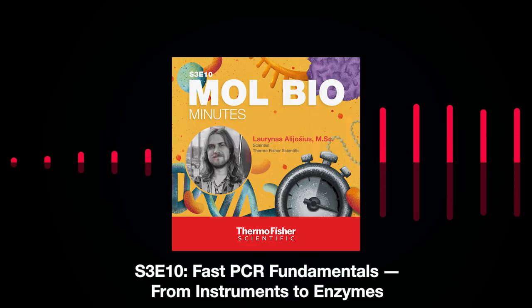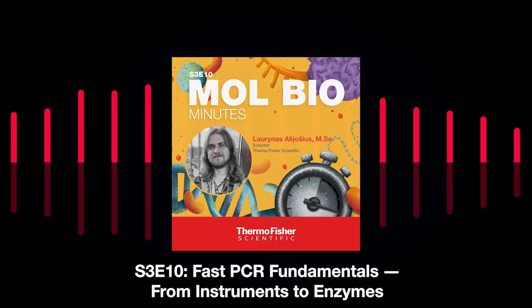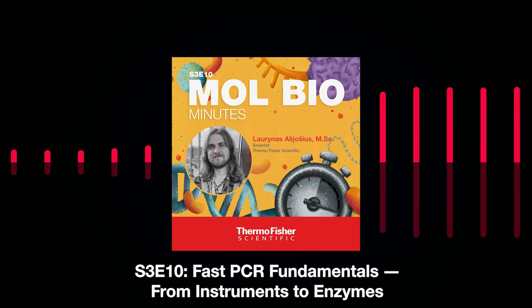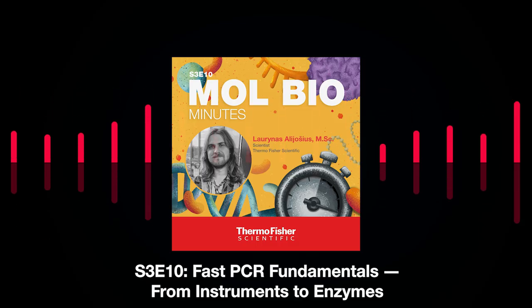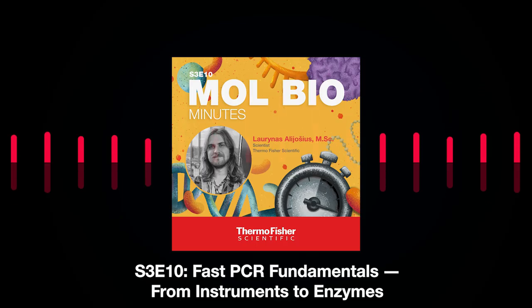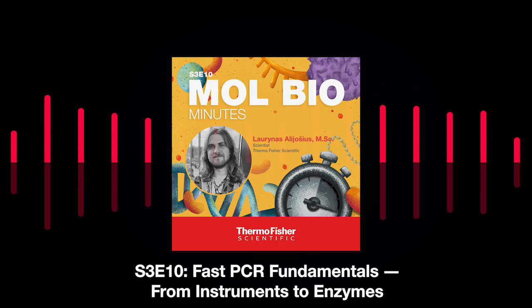So this would allow you to significantly shorten the PCR runtime. I think that master mixes and premix buffers are a very good choice for a PCR buffer for a fast PCR. But if you need to do some custom optimization of your PCR buffer, or if you're just curious to learn more and go deeper into this, you can access the resource link in the notes that reviews the 6 considerations for the PCR step optimization.